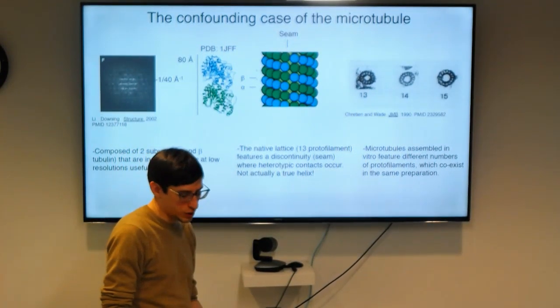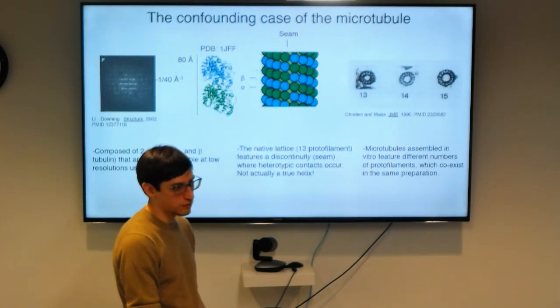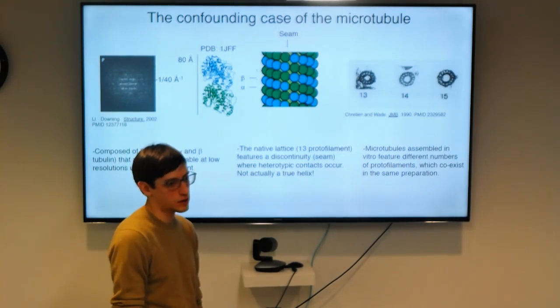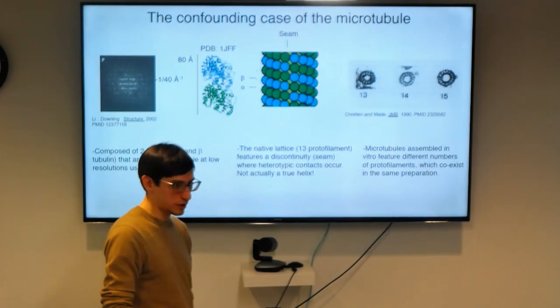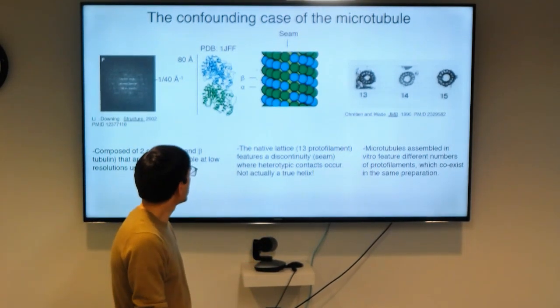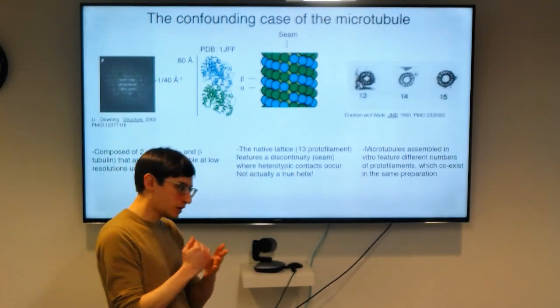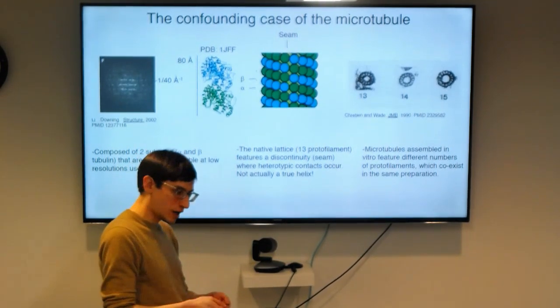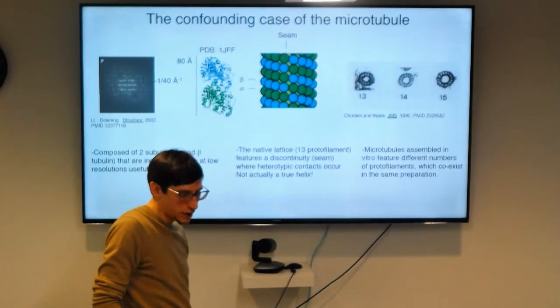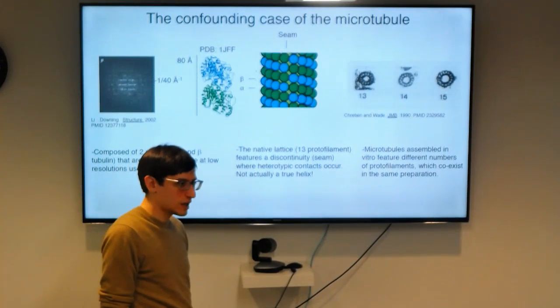So when you align single particle images, you're not usually aligning them based on the 4 angstrom resolution, you're aligning them based on the 30 angstrom resolution, where it's the same signal that your eye picks out in the image when you see there's a particle there. In the case of an amyloid, there is no such feature. The first feature is 4 angstrom. So you can't actually orient that, and neither can the computer, unless you manage to use Relion.